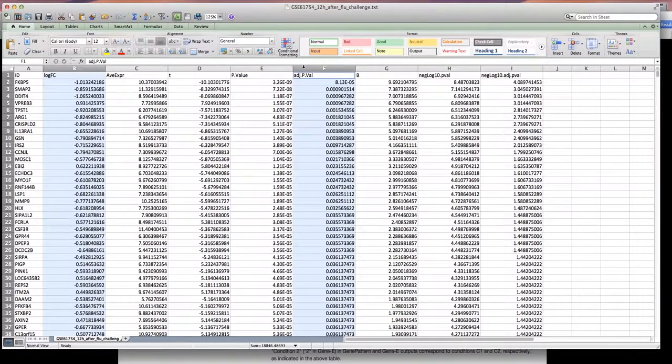The log fold change provides the logarithmic fold change in gene expression of condition 1 relative to condition 2. The more positive the number, the greater the expression of that gene in condition 1 relative to condition 2. The more negative the number, the higher the expression in condition 2 relative to condition 1. The adjusted p-value is used to determine which genes have statistically significant differences in gene expression. An adjusted p-value of 0.05 is the default setting. A list of statistically significant differentially expressed genes is available for download.